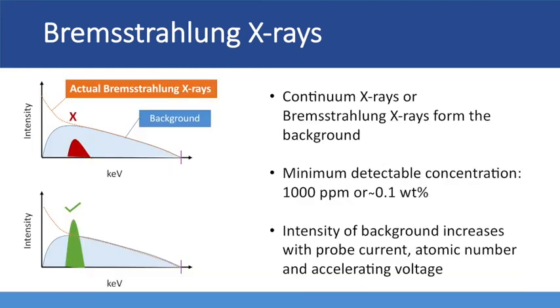They're known as continuous because they form a continuous distribution, like you can see in these graphs as the orange dotted lines. While they are continuous, the detector has a difficult time with the extremely low-energy generated X-rays, so it appears like the broad blue hump you see instead.